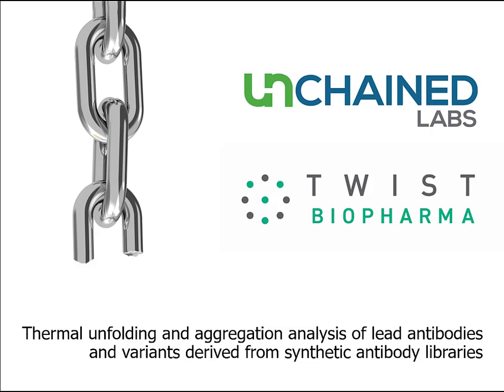I'll be introducing and giving some background to the thermal unfolding and aggregation analysis part of this webinar and the instrument used for much of the analysis.